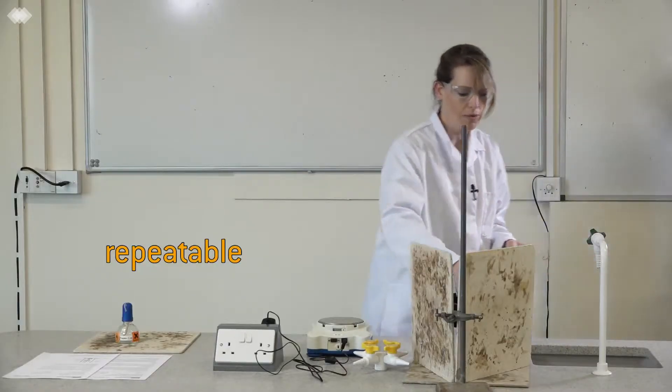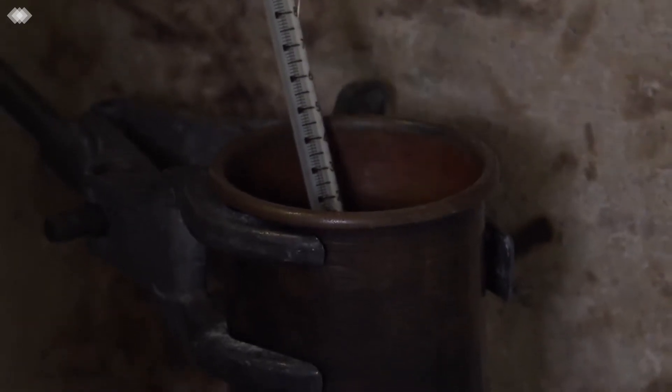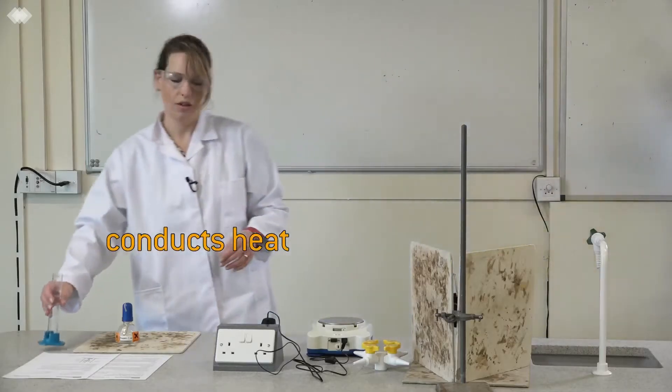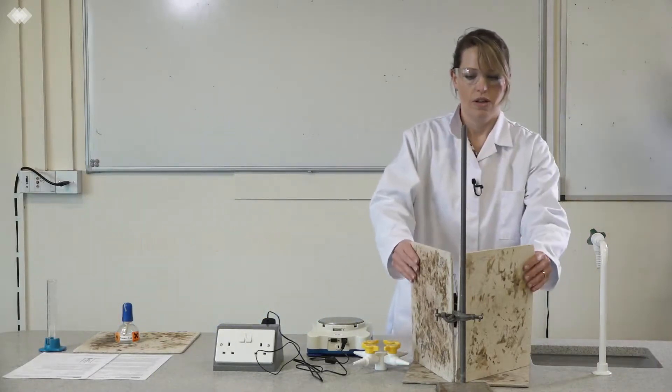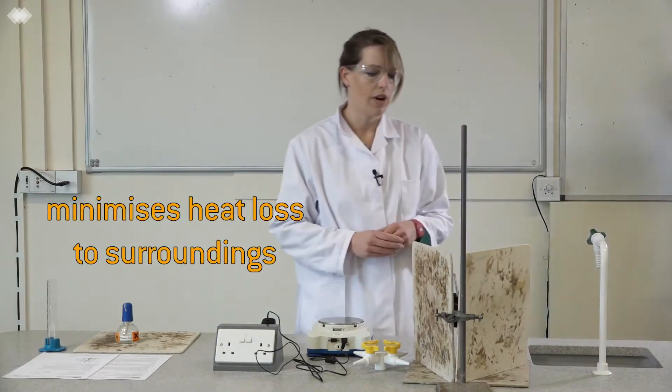It's important that it has to be measured accurately because it needs to be repeatable. Then put the water into the copper calorimeter. We use copper because it conducts the heat really well and minimizes any heat loss to the surroundings.